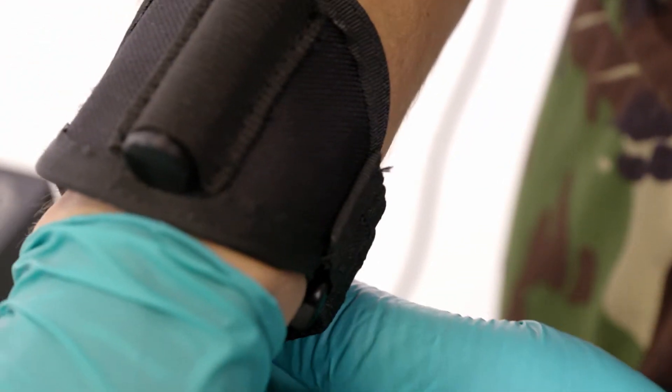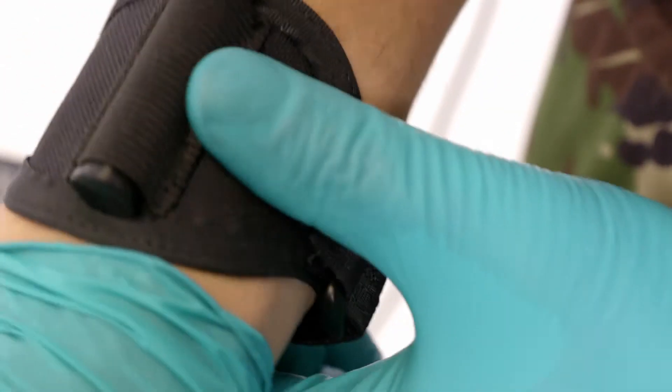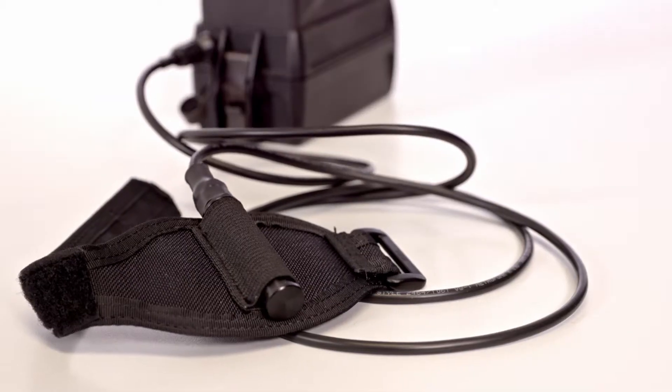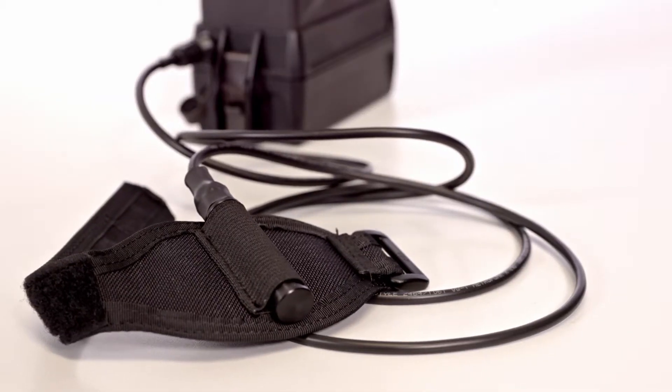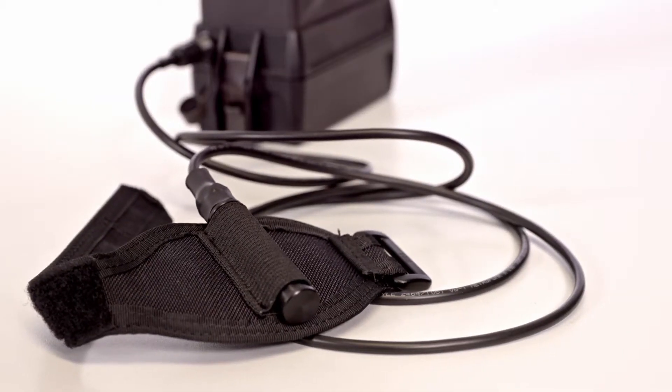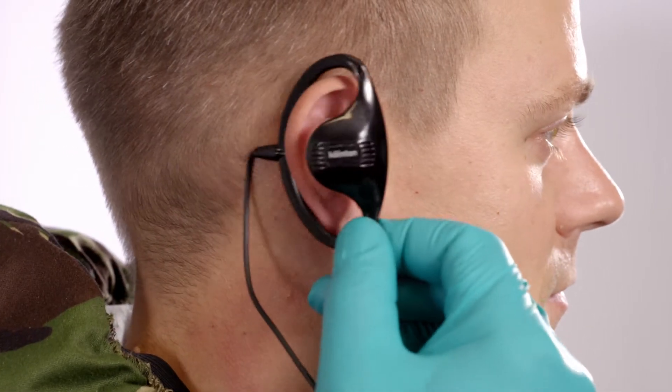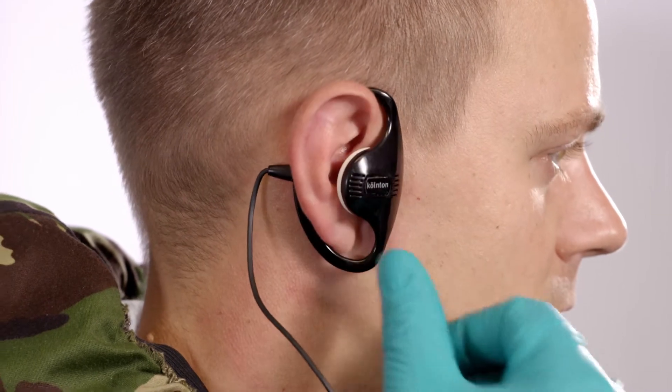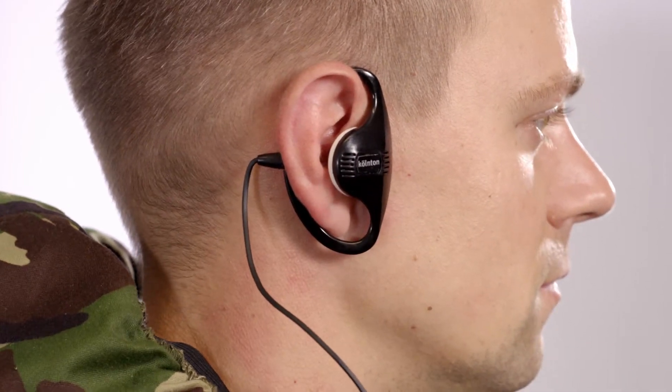This allows the system to be used as a body-worn personal detector. The vibration alarm and earpiece allow the operator to work hands-free without attracting unwanted attention.